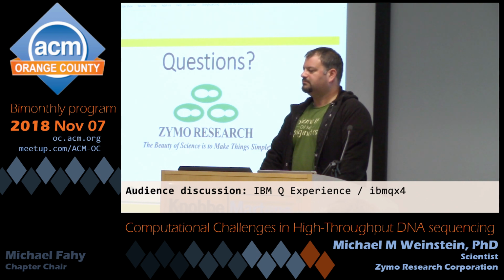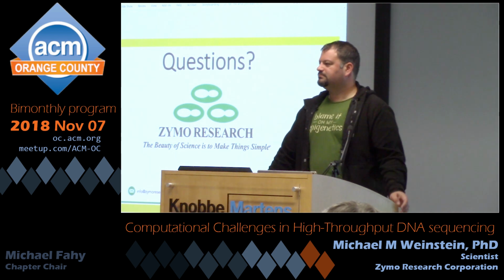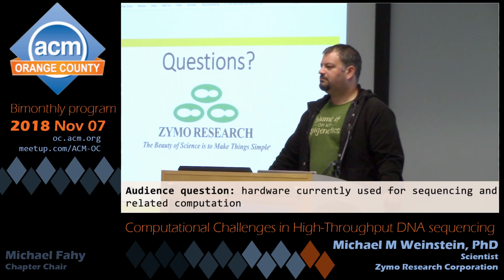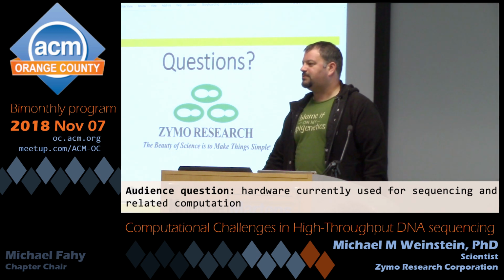So that's pretty cool. And then you mentioned, this might have already been asked because I walked away for a little bit, but what do you guys use to do all the computations? When I'm at UCLA, I use a cluster computer called Hoffman. If it's not a terribly huge job, or if it's sort of trying to develop something, I use a decently powered laptop. And if it's something that requires huge computing resources, then I use AWS.